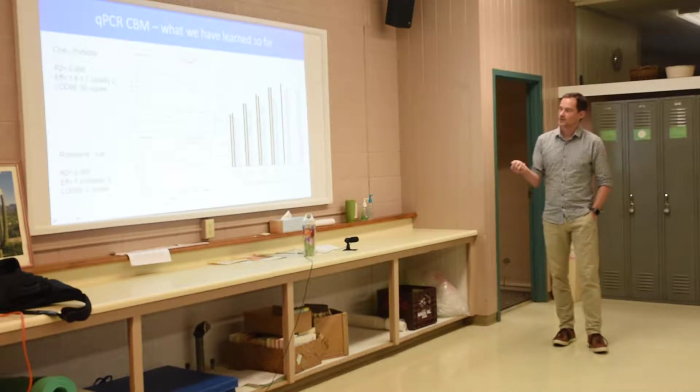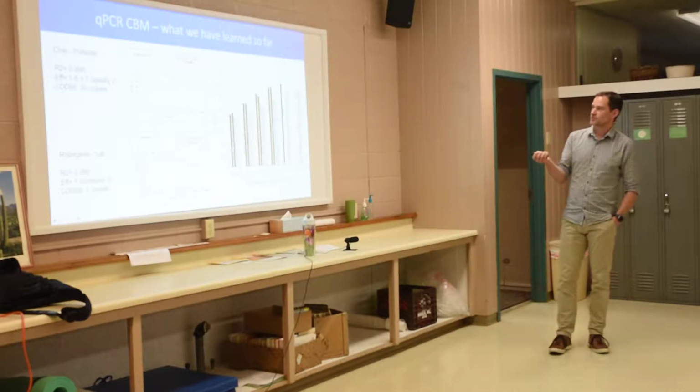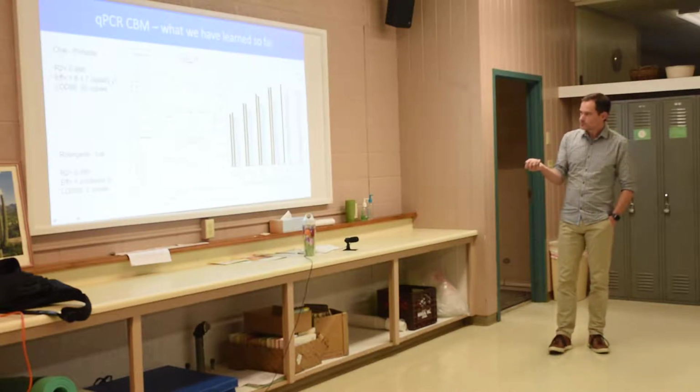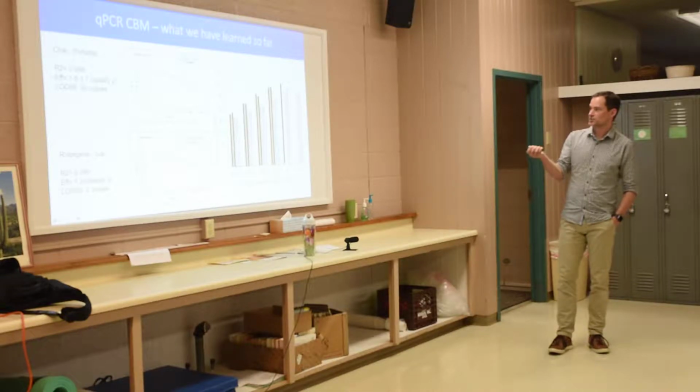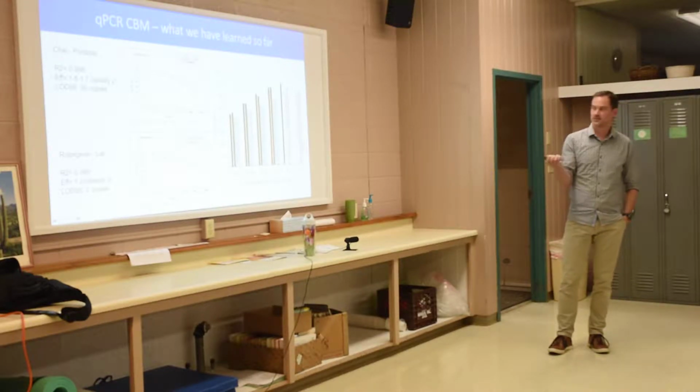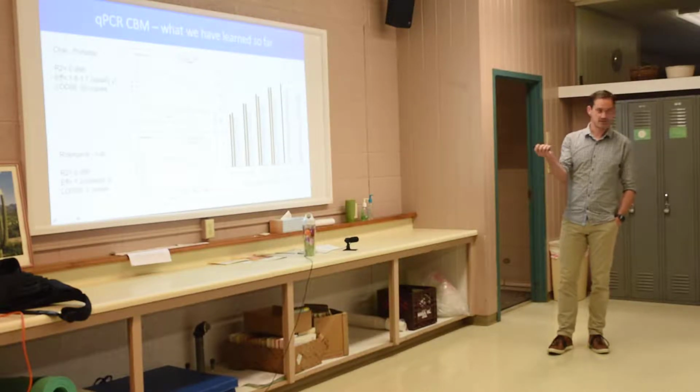What's important, though, is that the Chai performs the same as the core lab machines in terms of how it amplifies a target. So you can see these lines here and the R-squared values. Those are just technical ways of assessing the slope of the line and the relationship between these dots. The closer to 1 you are, the better the correlation is between your samples at these different dilutions where we have these known dilutions of a target gene. The point here is that the Chai actually gives us an R-squared value of 0.998, which is basically 1. That's like a ridiculously good relationship.